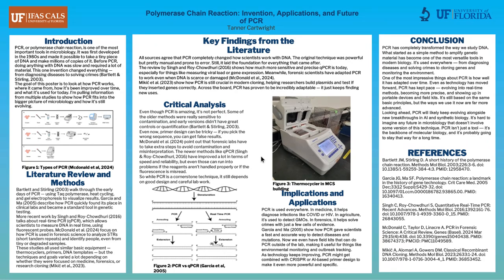real-time PCR. And really the difference with real-time PCR is you can just see what's happening using the fluorescence added into it. And then over on the middle right, we have figure 3, and that's just a picture of the thermocycler we used in the lab. I took that photograph myself.